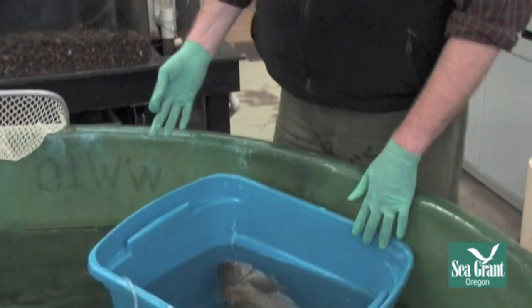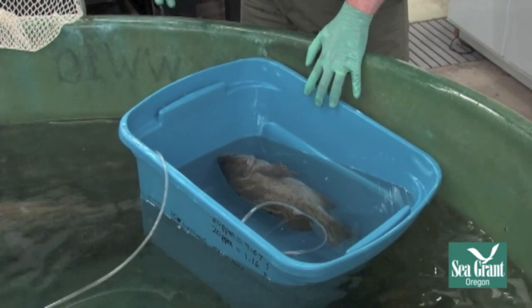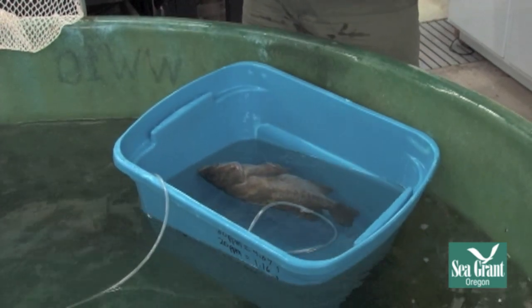I have a fish that I've just sedated here. This is a copper rockfish. You can see it's breathing nice and regularly, but it's non-responsive and it's to a point where it's not going to feel much pain or anything. Not that we're going to do anything particularly painful.